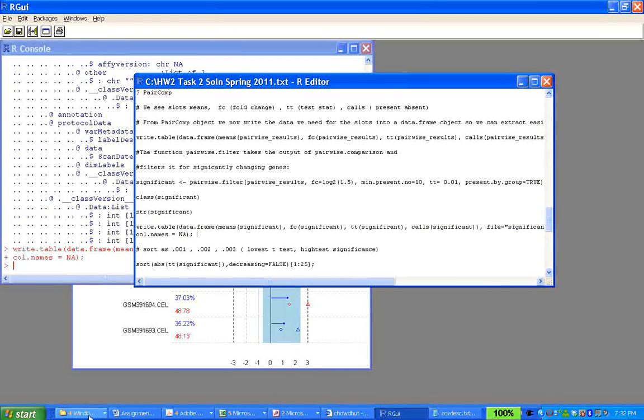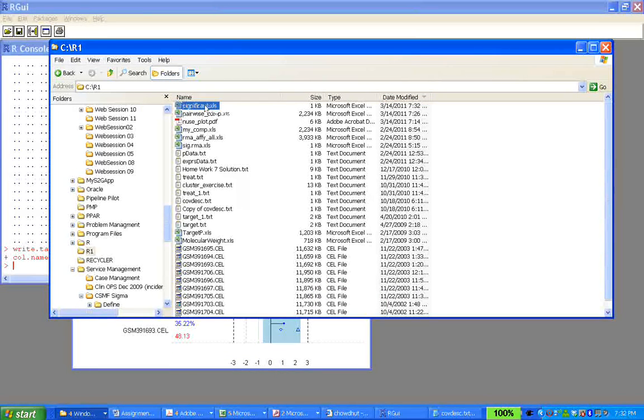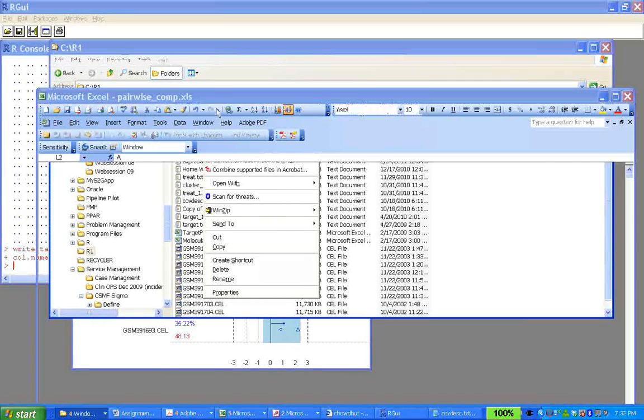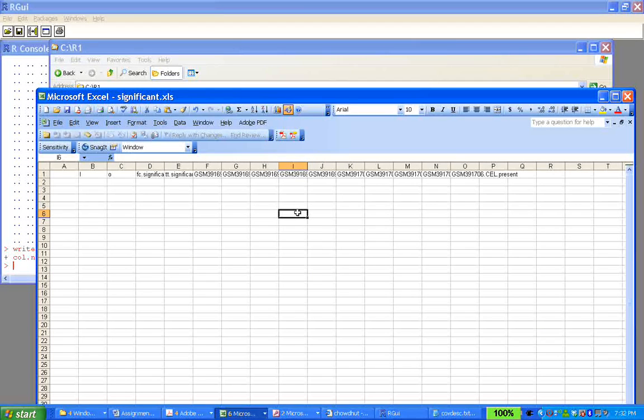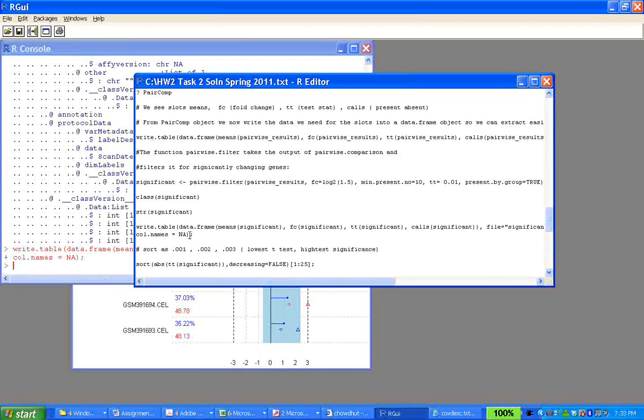So we just did that, right? So let's look at the significant, and it has to be when group by false. Okay, so actually when you did group by false, none of them actually meets the criteria, group by true, right?